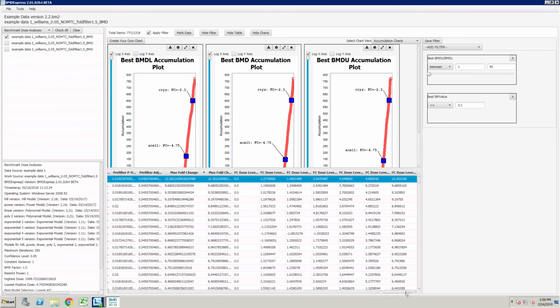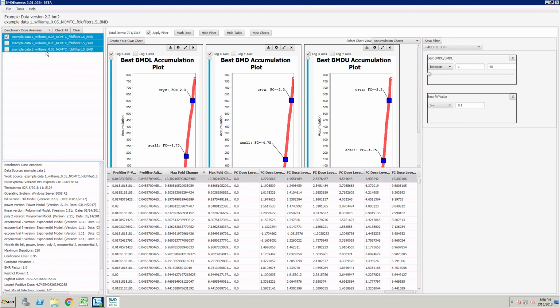And then it also brings you down all the dose levels, the fold change at different dose levels. So you can evaluate the data at the BMD analysis level. But really where the power of this comes in is not necessarily in looking at these individual genes. While that is, of course, very powerful, the next step in the analysis is to take these genes with their associated BMDs and then parse them into GO terms or pathways or your own favorite collection of gene sets. We like to use the Hallmark gene sets from the Broad Institute sometimes, so you can use those also.